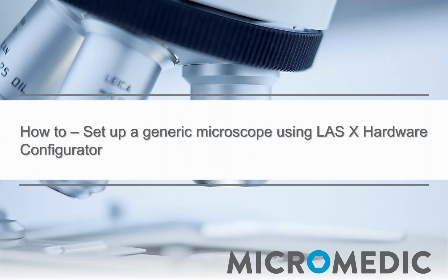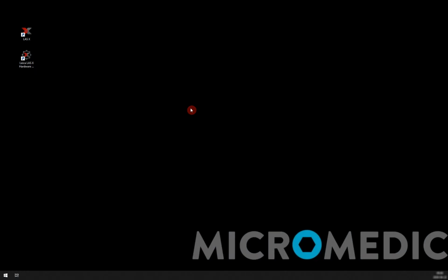In this video, we're going to have a look at how to set up LAS X to be used with a generic microscope. For example, if you bought a Leica camera and you want to use it on a different brand of microscope or an older model of a Leica microscope, you need to set it up as a generic microscope. So we do this in the LAS X hardware configurator.